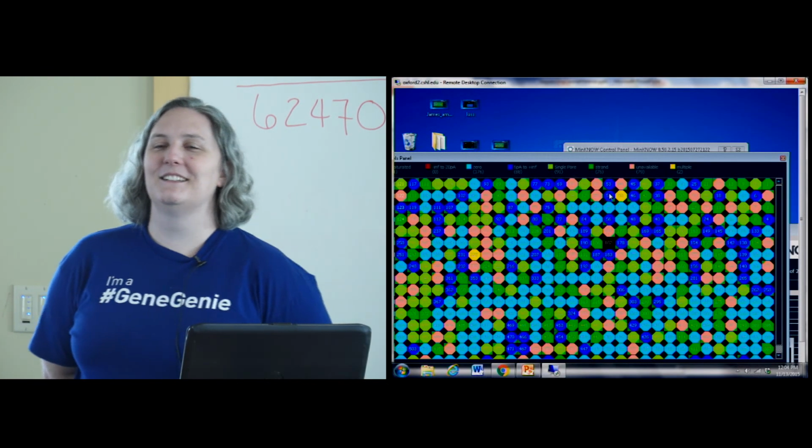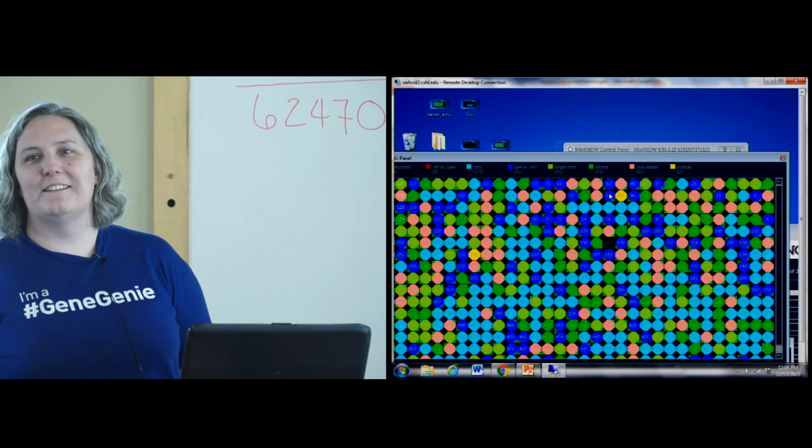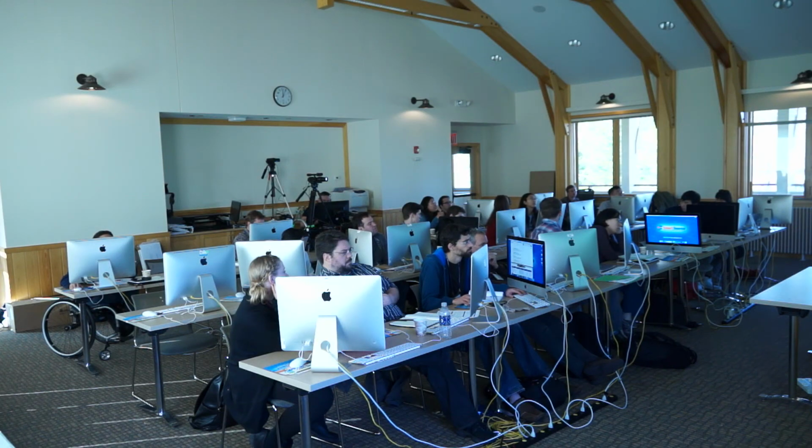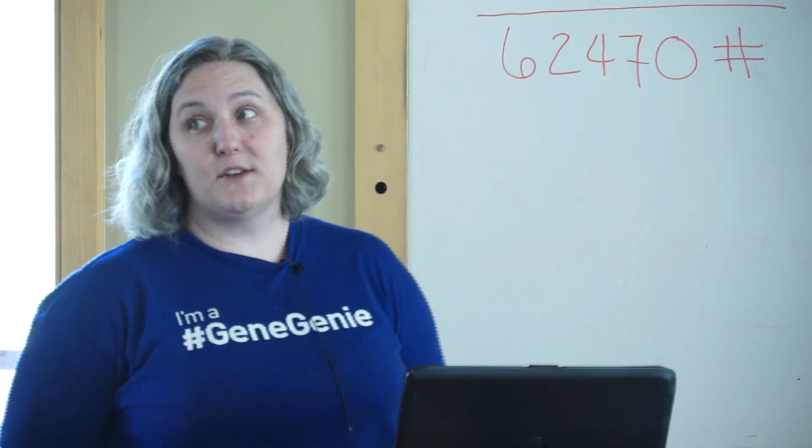How much does it cost from sample preparation to the data, all that stuff? Well, the actual reagents are $500 for the box of reagents. I think maybe it's $599 now. That's good for 3 runs. Each flow cell runs about $1,000. So that's about $1,500 for the run. The tools, fortunately, are all freeware, so you don't need to pay for any of them.